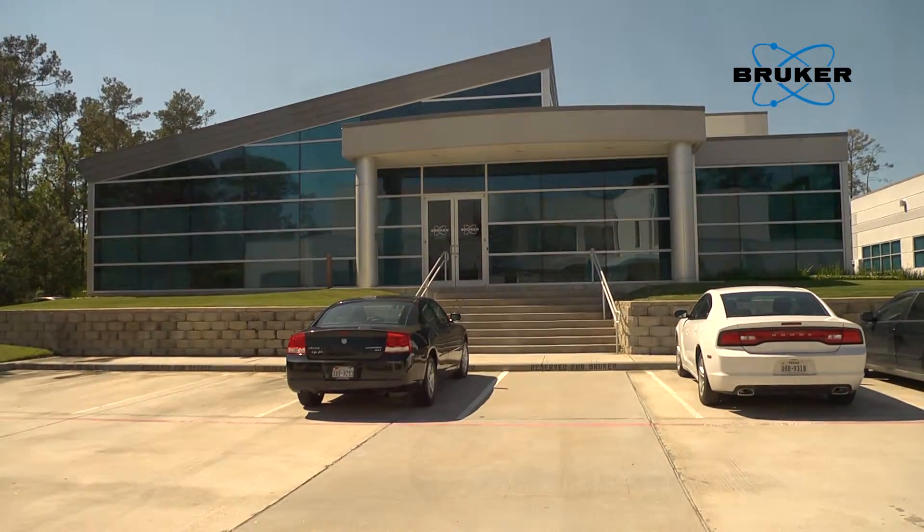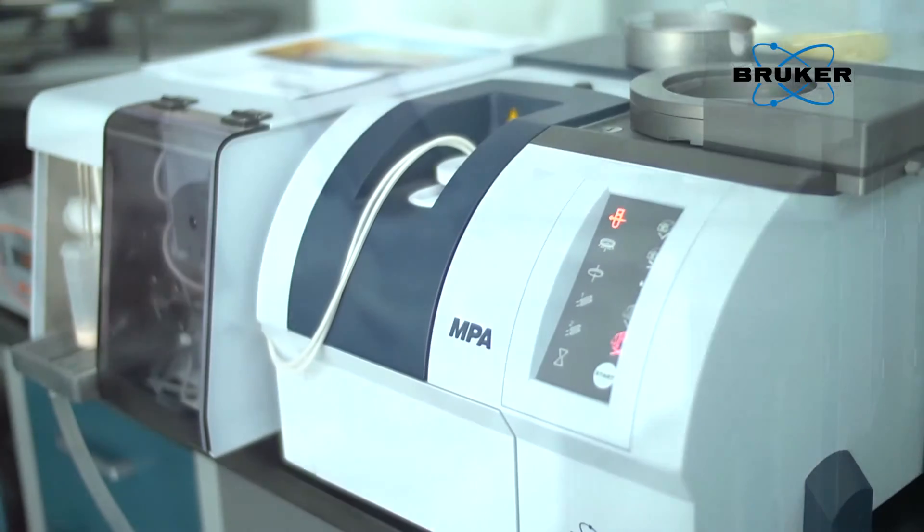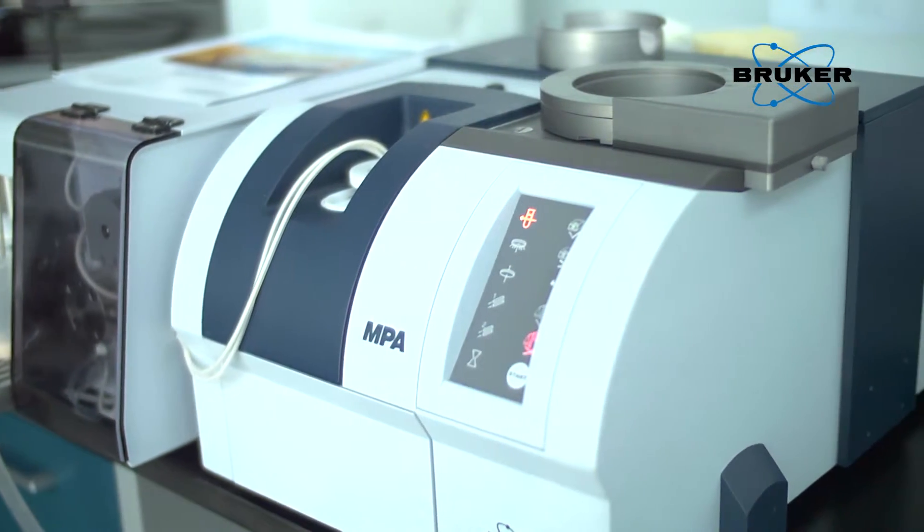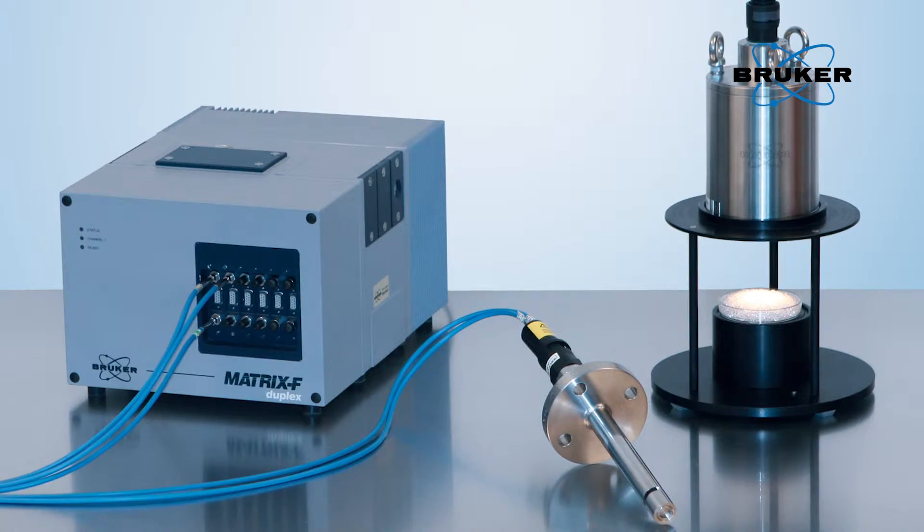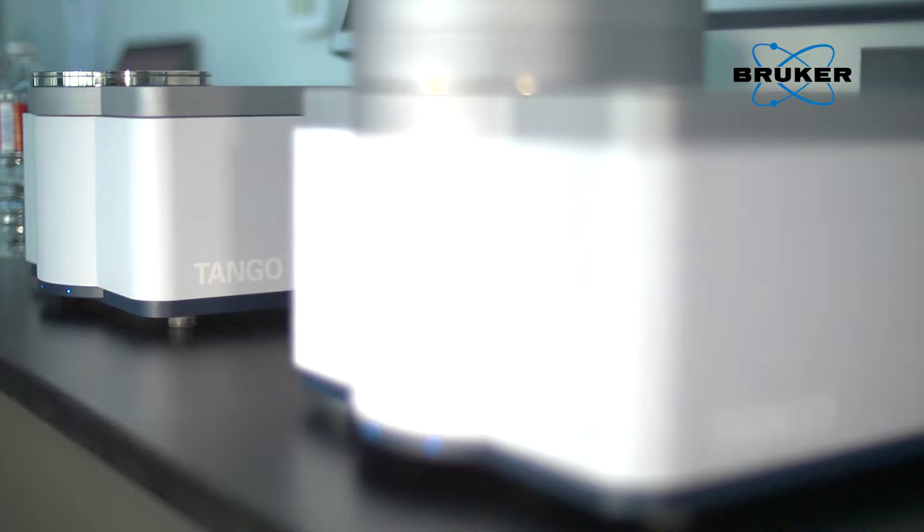Bruker's FT-NIR product line includes the Tango, the MPA, and Matrix-I spectrometers for lab and at-line applications, as well as the Matrix-F series for process control. Faster, simpler, more secure.